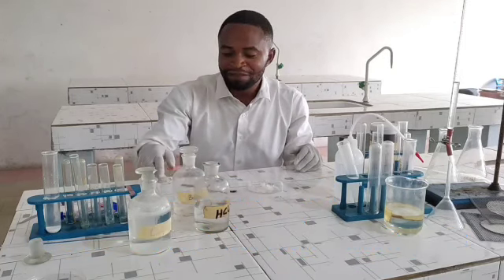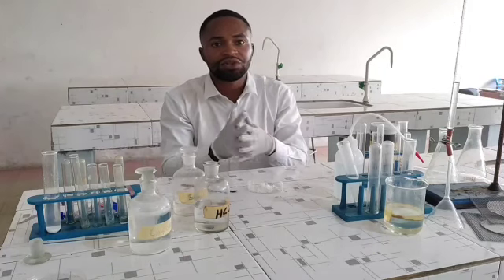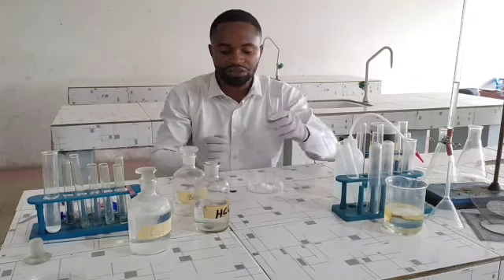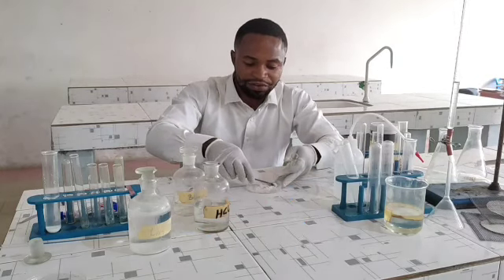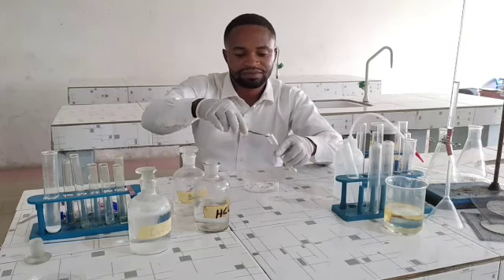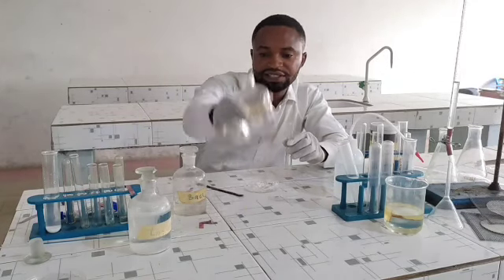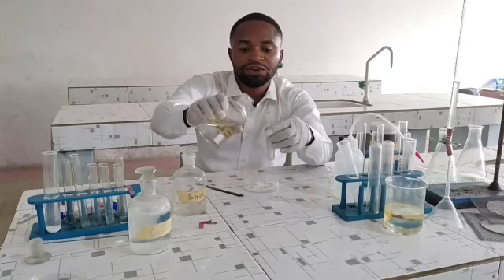As simple as that. The next question they are likely going to ask you is to take a spatula of sample C and test with dilute hydrochloric acid. Now let's go. Observe me, come with me, see what I'm saying. I'll use my spatula, take sample C and put it in a test tube. You see this? Now, the next thing I'm going to do is to take my dilute hydrochloric acid. This is my dilute hydrochloric acid. I'm going to add about 5 ml of dilute hydrochloric acid.